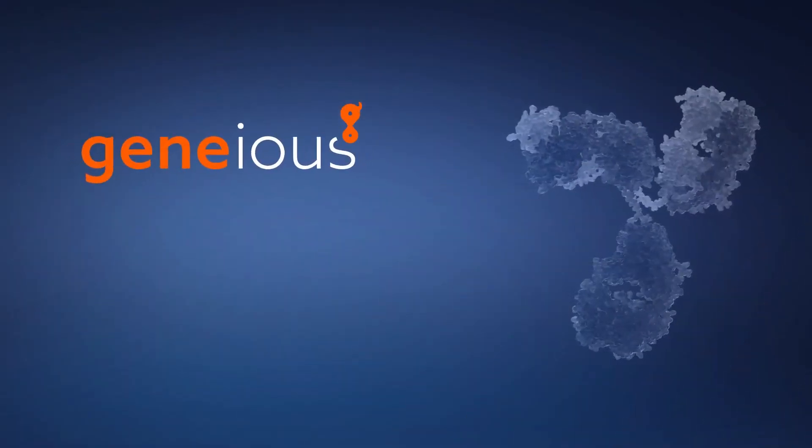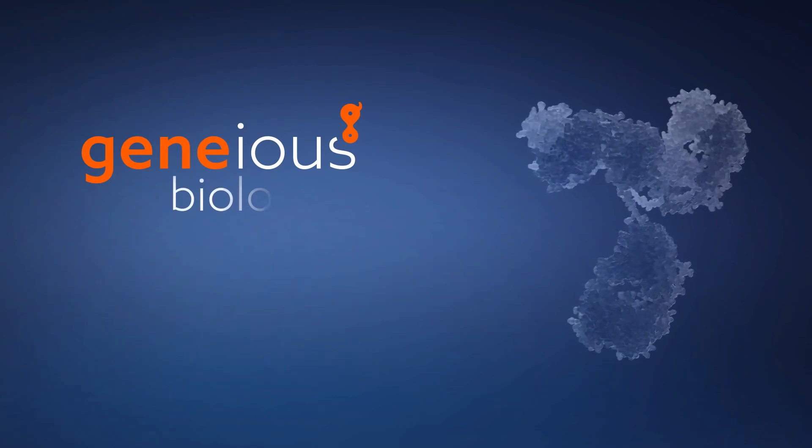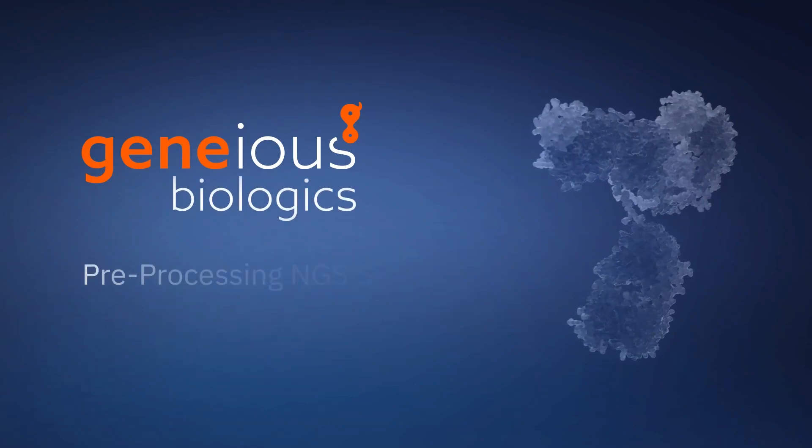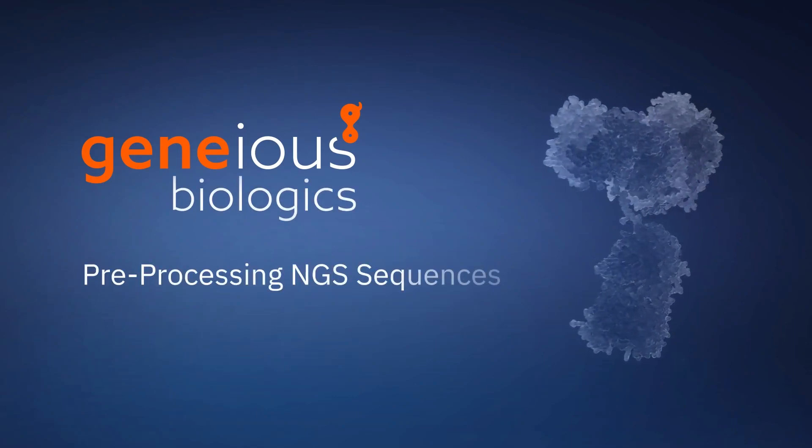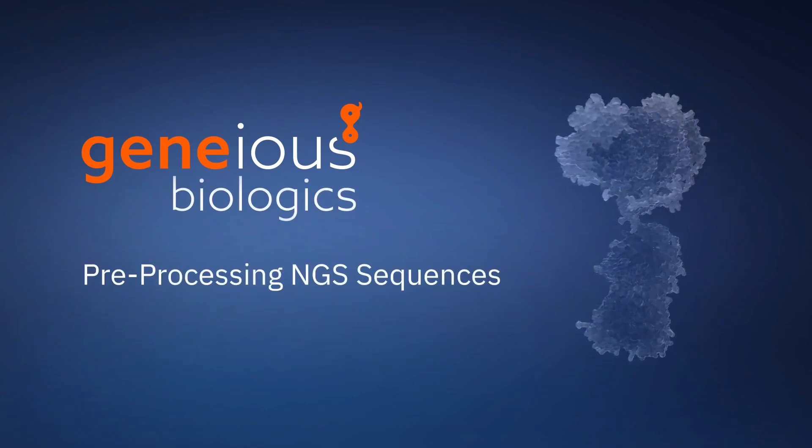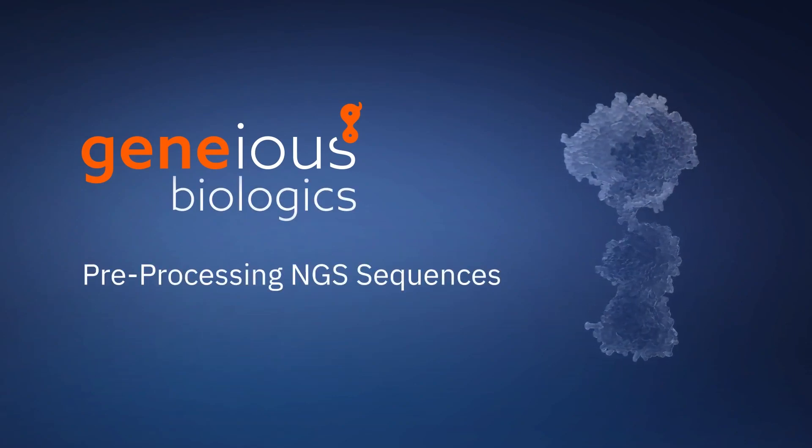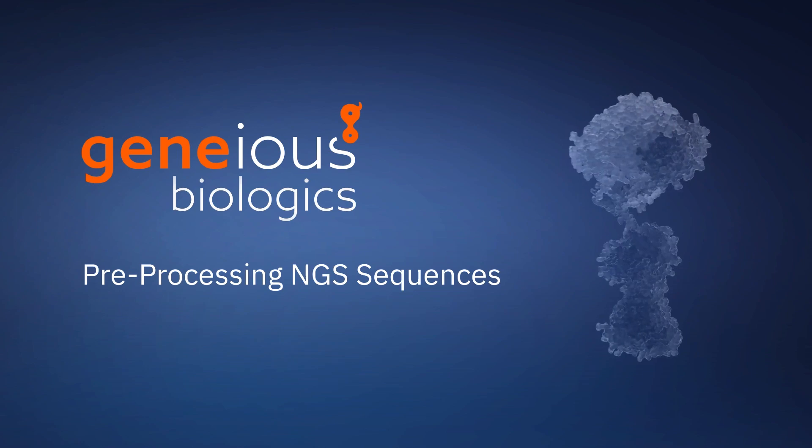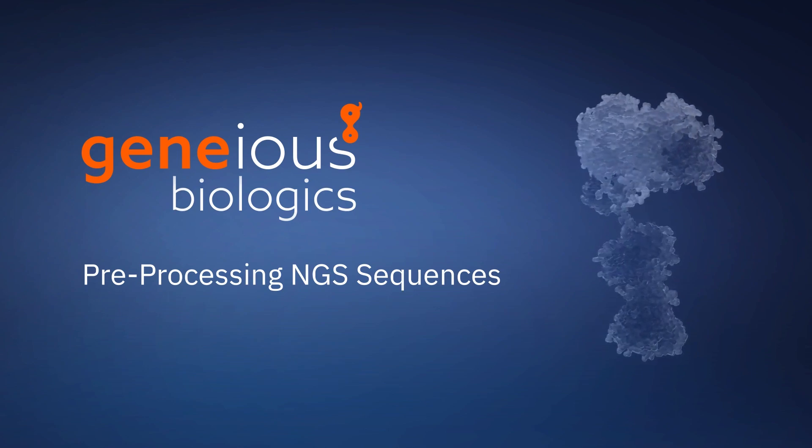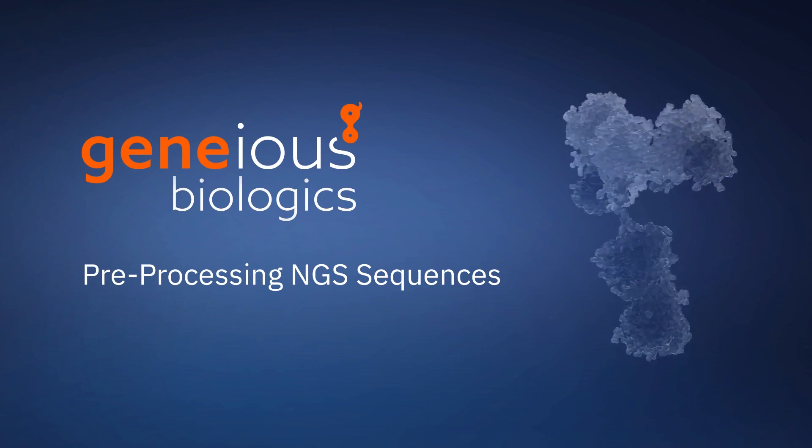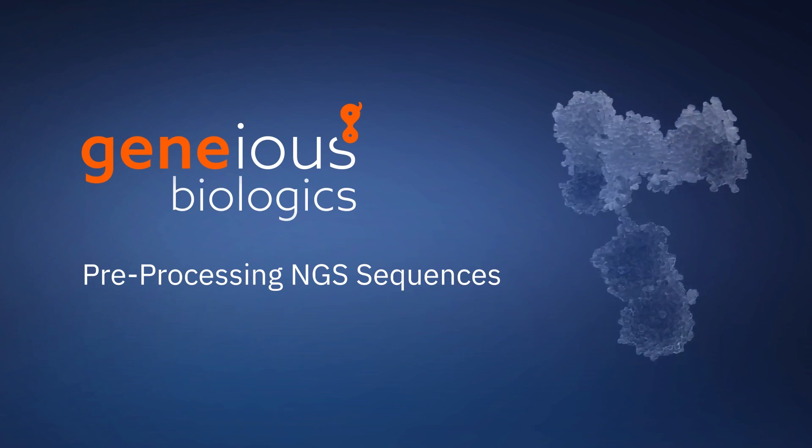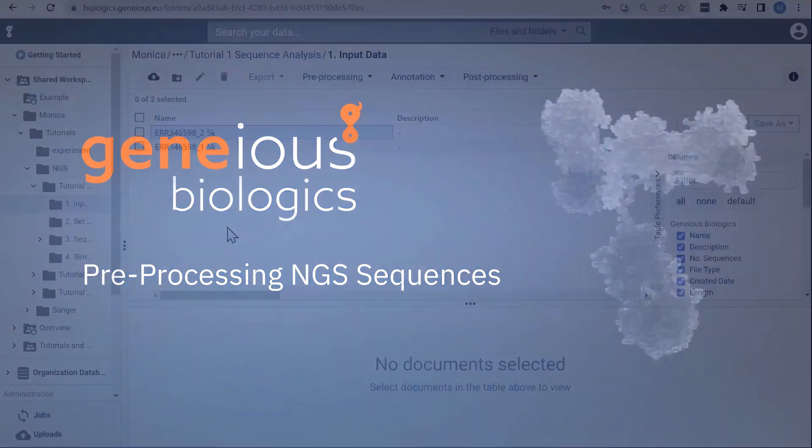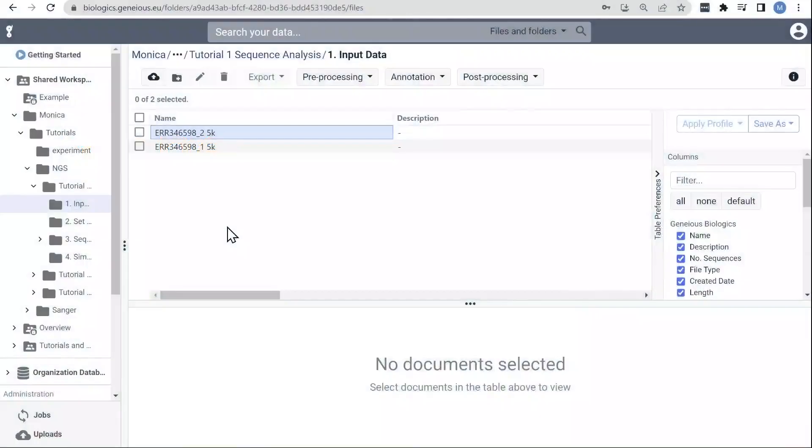Welcome to this tutorial video on pairing and merging large antibody sequence datasets produced by next-generation sequencing methods, as well as a brief overview on processing barcoded sequences. For large sequence datasets generated by various NGS technologies, you may need to perform some preprocessing steps prior to annotation.